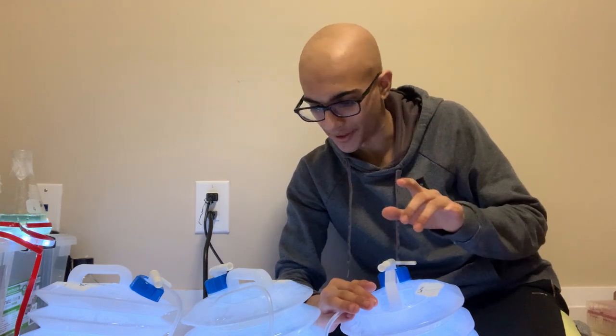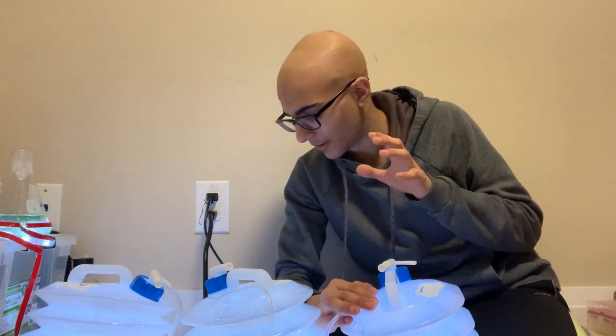So there you go. Phase 2 of my experiment has officially started. I'm really excited for how this is going to go. I think I've learned a lot over the course of phase 1, and I think phase 2 has the potential to give me some really good results. And I'm really excited about that.